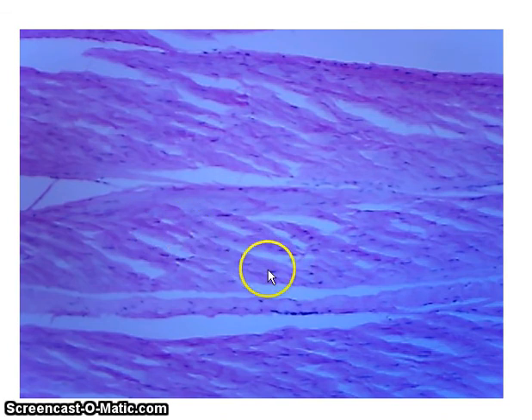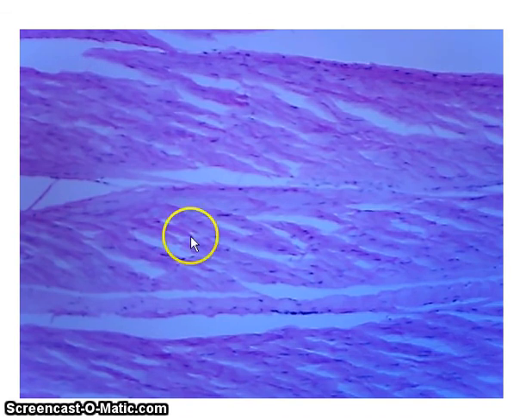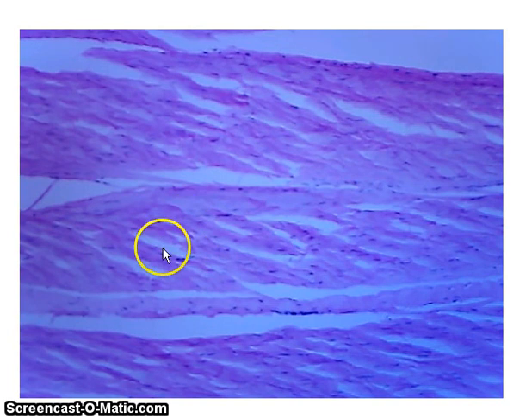And remember, dense fibrous or dense regular connective tissue, the collagen fibers are densely packed together and they're very parallel with each other and tightly packed. That means they're very strong in one direction. They have really strong tensile strength. So these little white spaces, these are just open spaces that separate collagen bundles. So there's a collagen bundle right there.